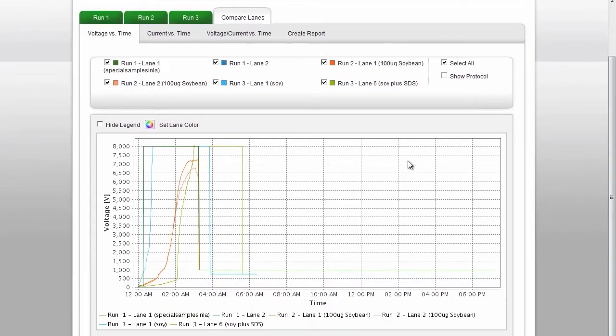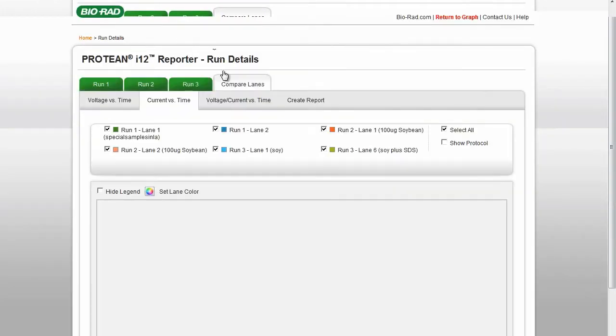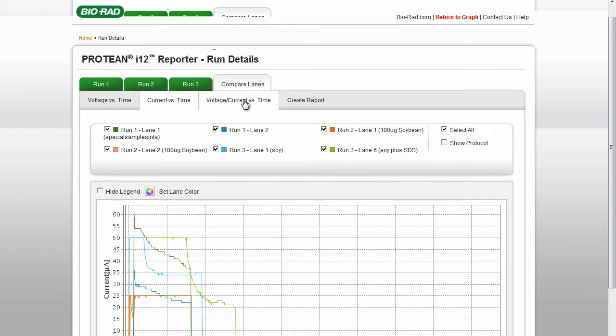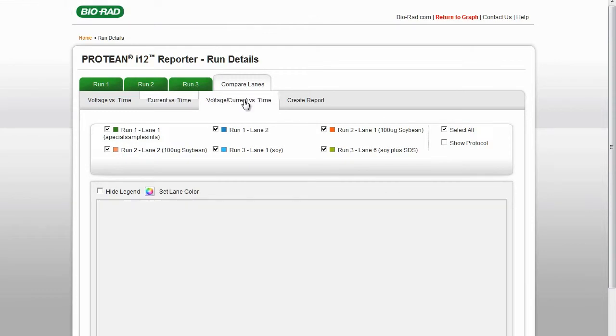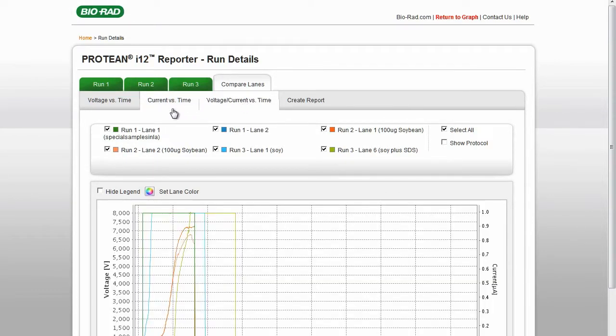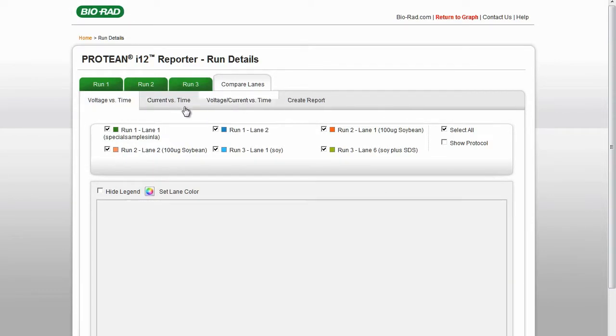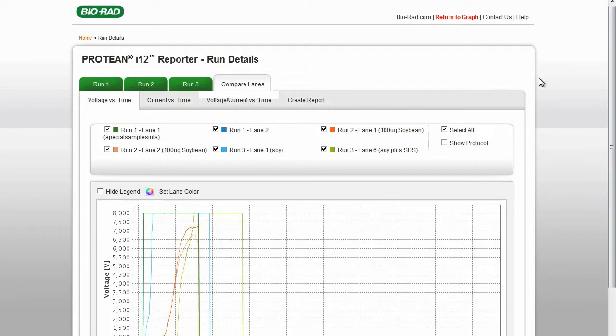You will have the option of viewing the Voltage vs. Time, Current vs. Time, and Voltage-Current vs. Time graphs, or creating a report.